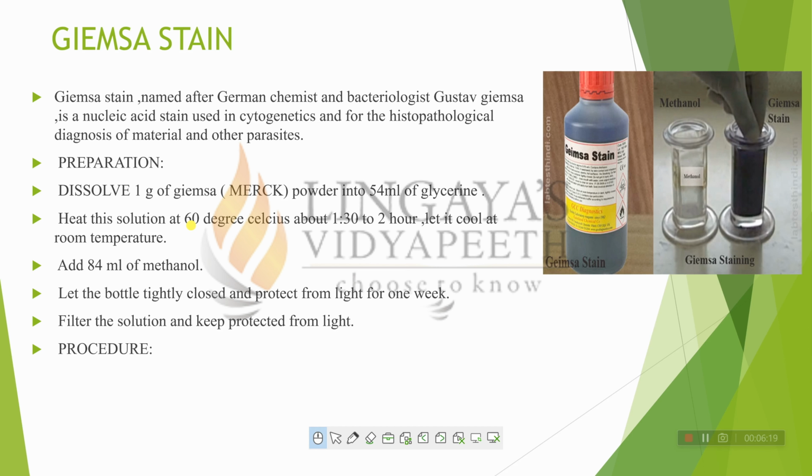Alright, Giemsa stain is used for the Giemsa staining which is also performed in the hematology department. The Giemsa stain is also performed in the histopathological department and also for the cytogenetics.